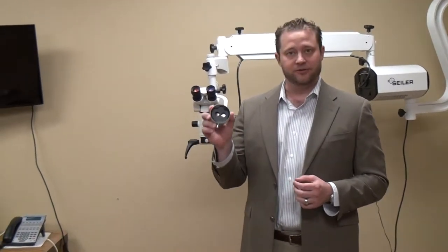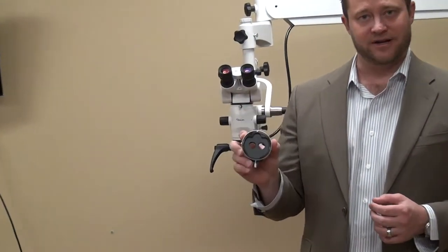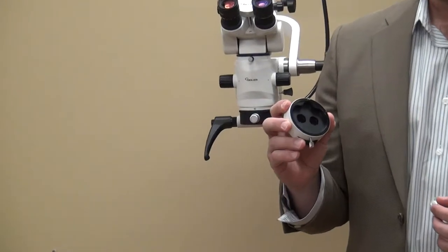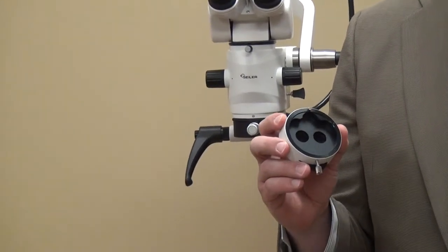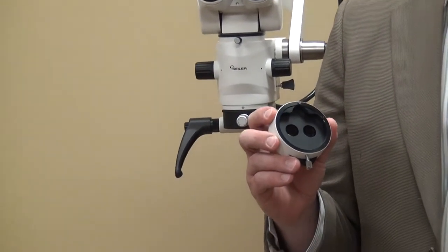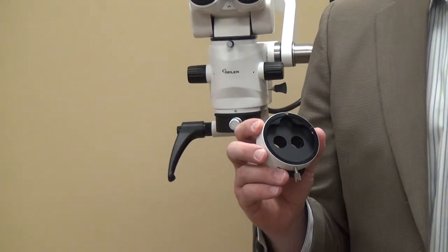I wanted to show you our new dual iris diaphragm and what this is for is to create a better depth of field when using the microscope, especially on the higher magnifications.